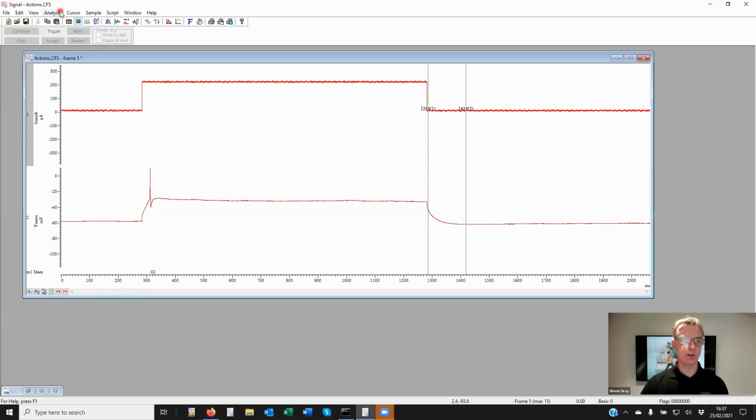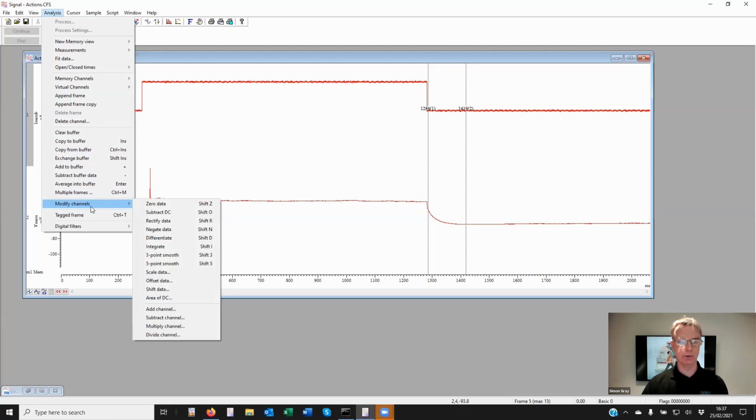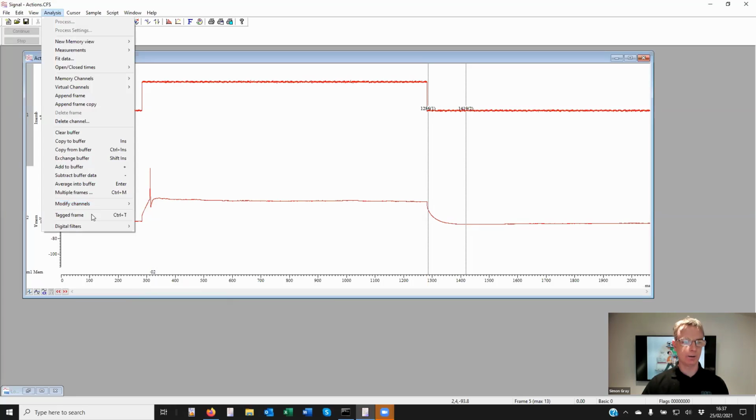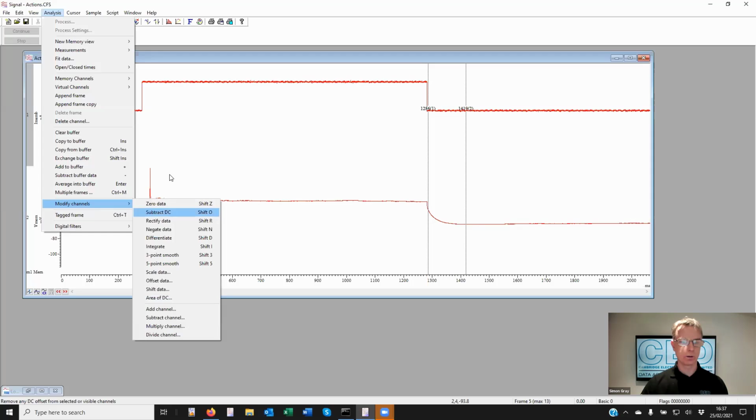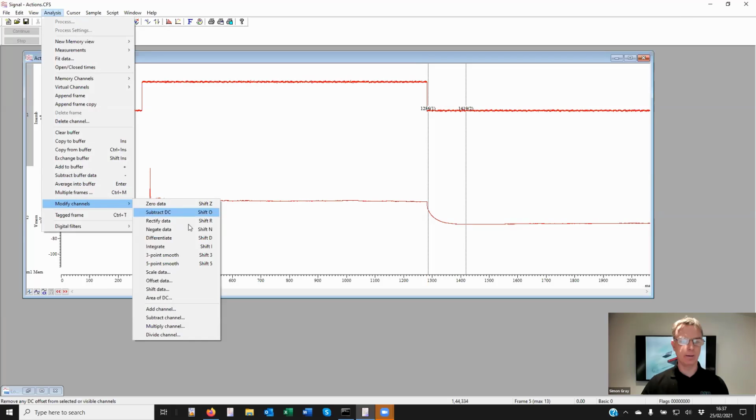The channel arithmetic has largely been superseded by virtual channels. There are various other things we can do here. Rectify and negate the data. 3-point smooth, 5-point smooth. Scale the data.